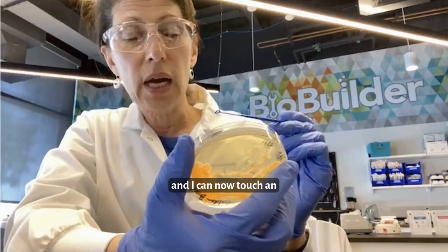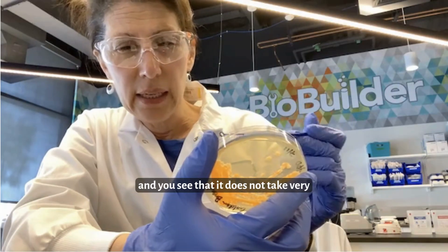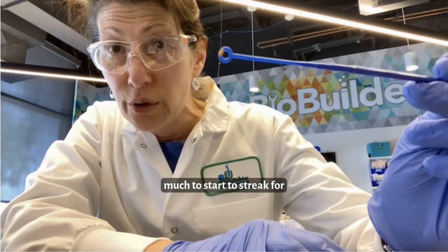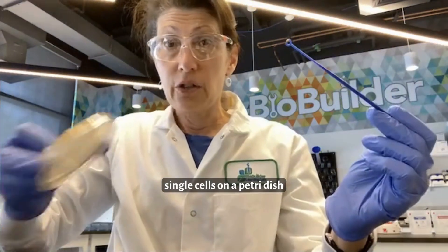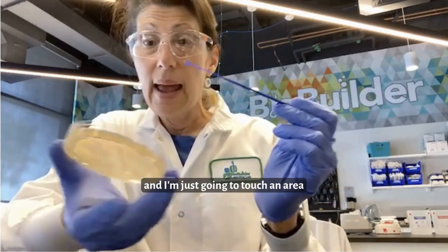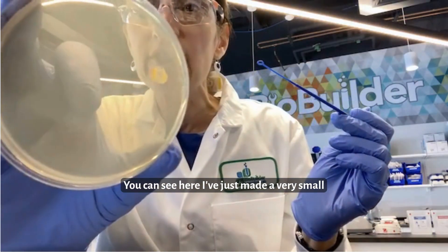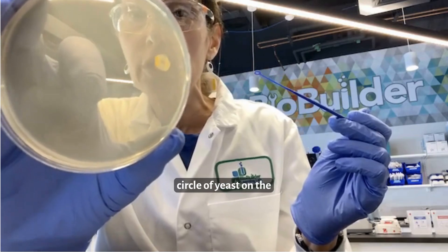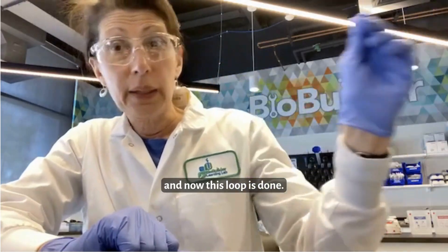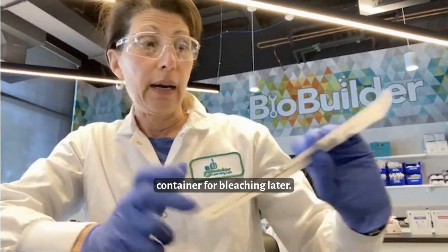I can now touch an area of this petri dish. I'm going to scoop up a single orange colony. You see that it does not take very much to start to streak for single cells on a petri dish of YPD agar. I'm going to take this single loop of cells and just touch an area of this petri dish. You can see I've just made a very small circle of yeast on the surface of this sterile YPD plate. Now this loop is done — I'm going to put it into our waste container for bleaching later.